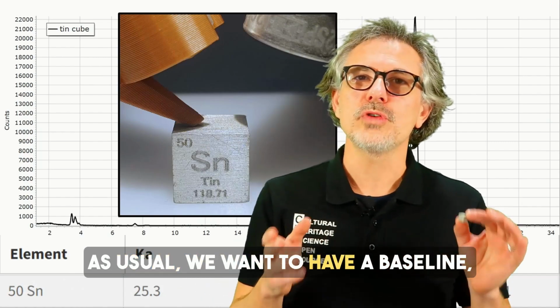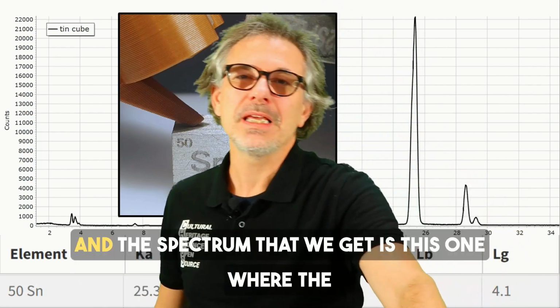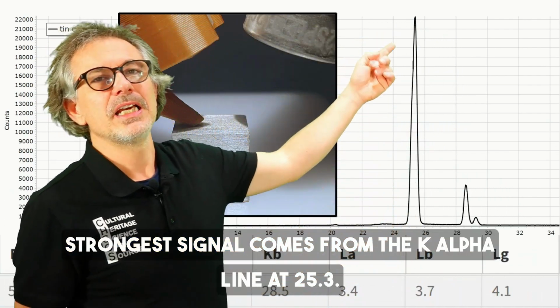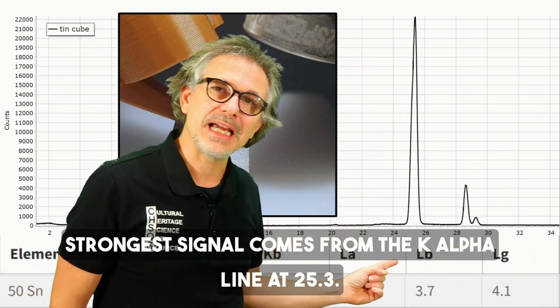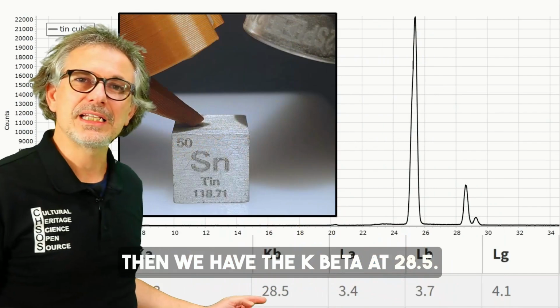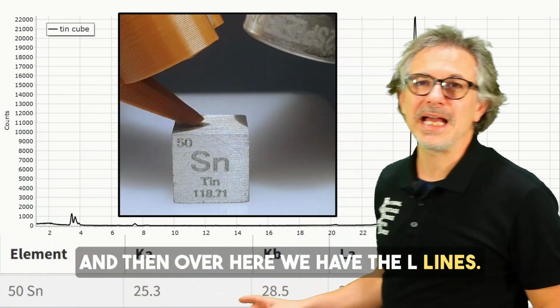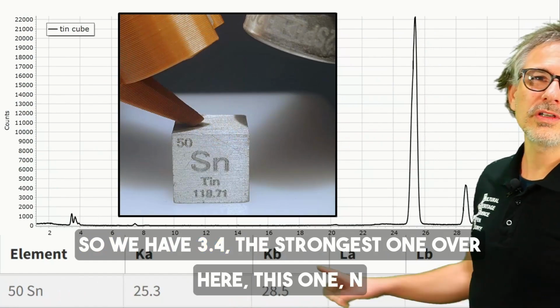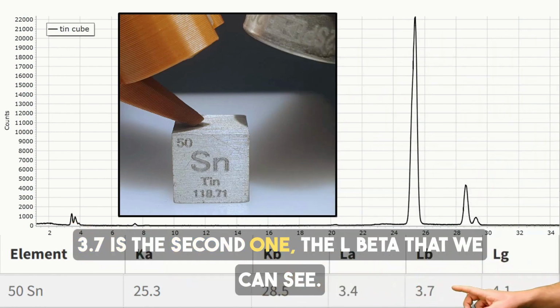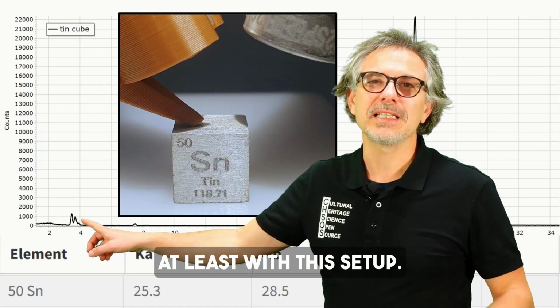As usual, we want to have a baseline, so we analyze a cube of pure tin, and the spectrum that we get is this one, where the strongest signal comes from the K alpha line at 25.3, then we have the K beta at 28.5, and then over here we have the L lines. So we have 3.4, the strongest one over here, and 3.7 is the second one, the L beta that we can see. L gamma we can't actually see, at least with this setup.